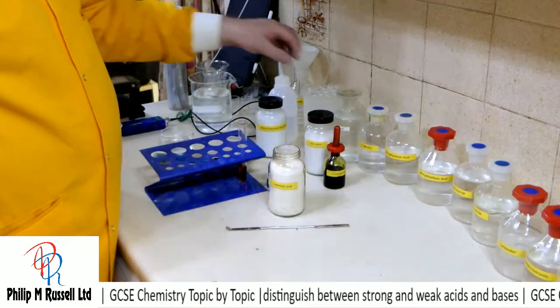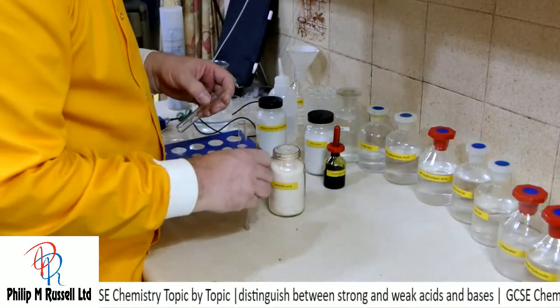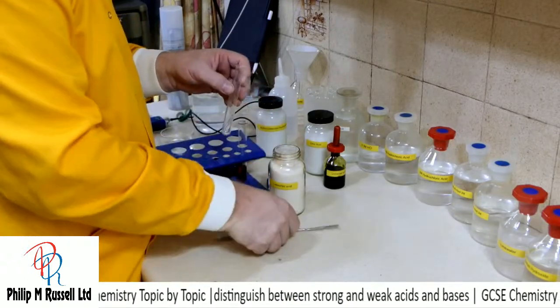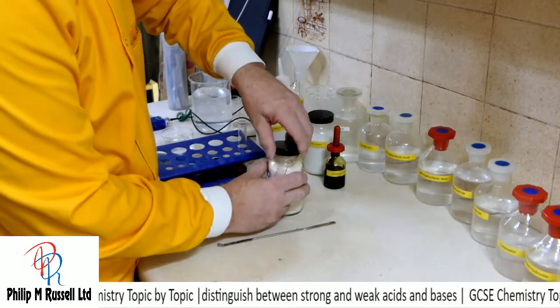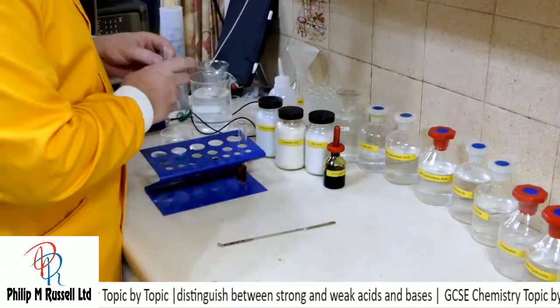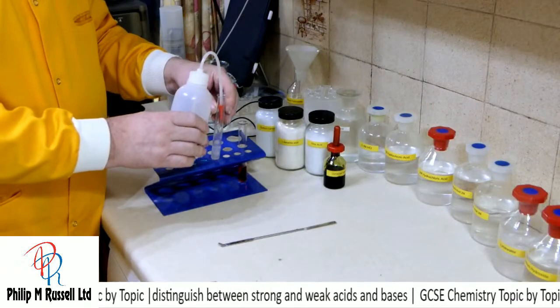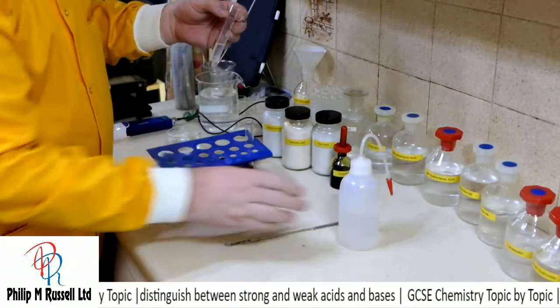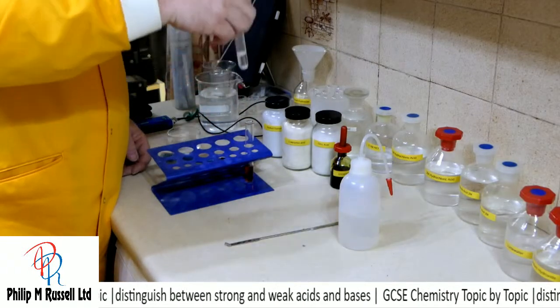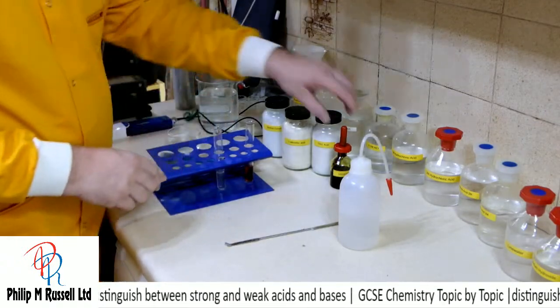Let's put it into a test tube and we'll see what this is like. So a bit of ascorbic acid. Let's dissolve that. Give it a good shake. It dissolves really readily.